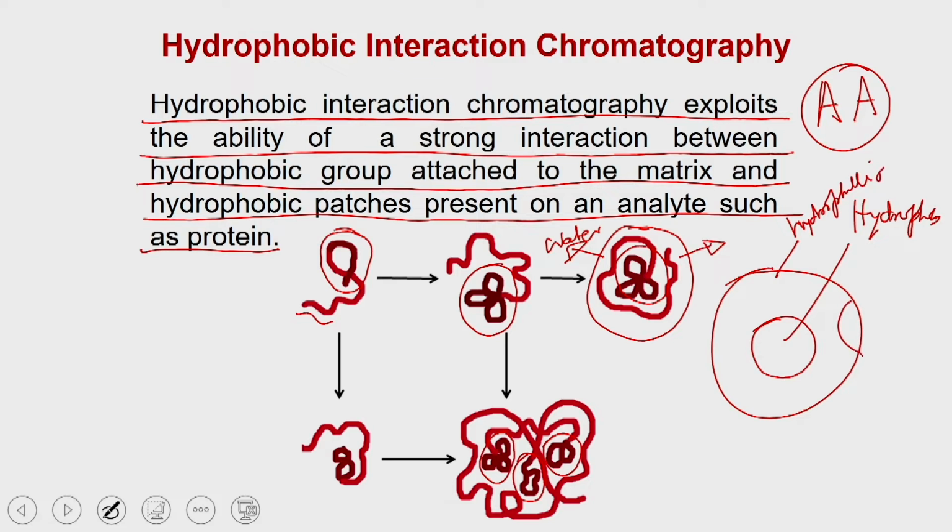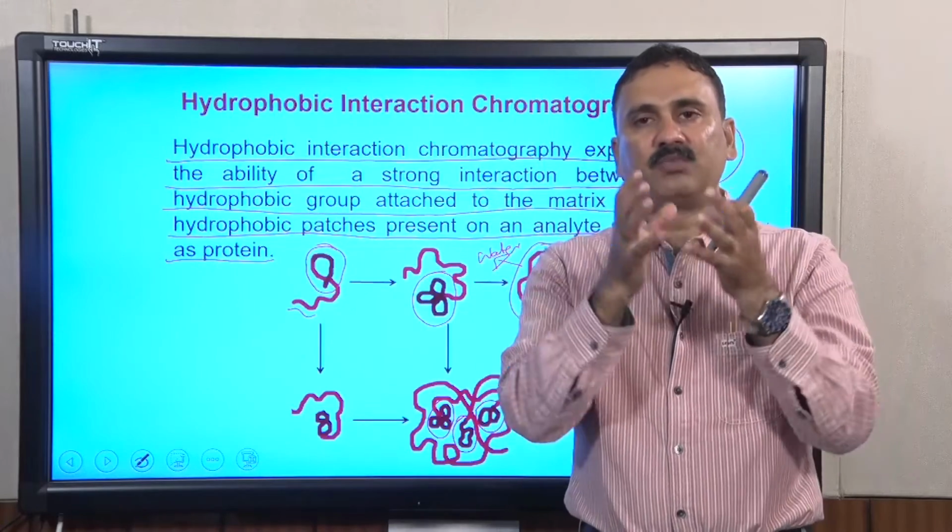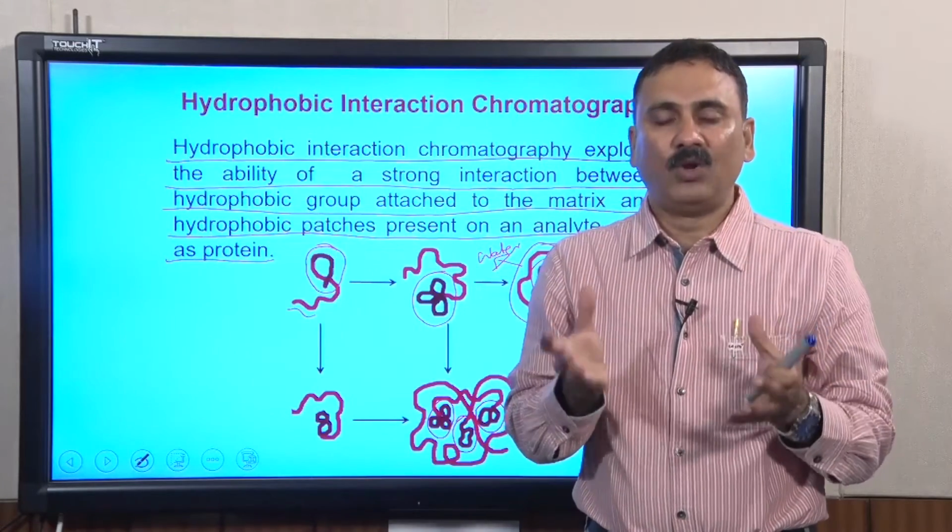Apart from that, protein molecules also have different types of hydrophobic patches, and these patches are also covered by the presence of water outside. This water is actually a part of the hydration shell. Every protein present in a biological fluid is covered by tiny water molecules, so that the protein is always present in an aqueous environment, and that protects the protein and conserves its biological activity.